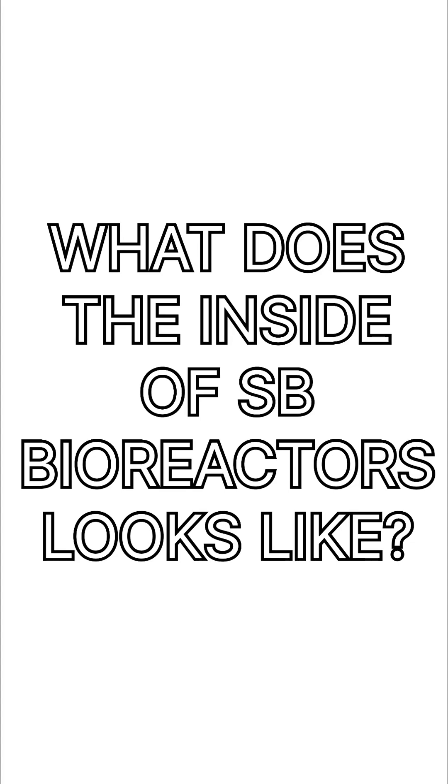Hey you! Have you ever wondered what the inside of a Shree BioCare bioreactor looks like? Well, this entire video is made just for you, offering an exclusive glimpse into the precision and craftsmanship behind our world-class bioreactors.